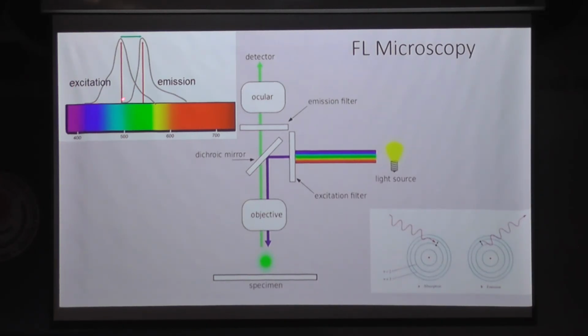The same fluorophore can get excited with smaller wavelengths and also slightly longer wavelengths. All those wavelengths at which the fluorophore gets excited are called the spectrum of excitation. Even if the wavelength is a little less or a little more, the optimal one is this one. This is the highest excitation. But if the wavelength is a little less or a little more than the actual excitation, the fluorophore still emits some light, but that will not be optimal. If we plot this graph, it comes out as a spectrum. This is the excitation spectrum.